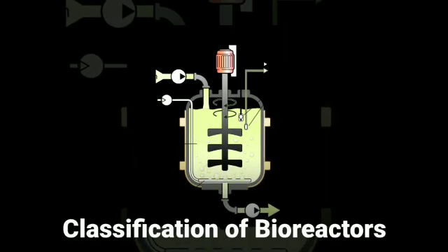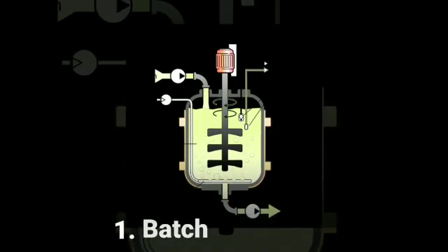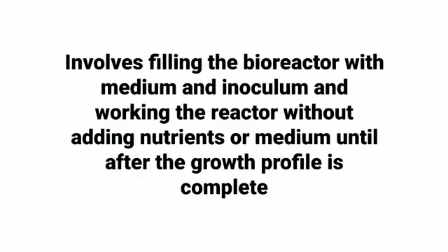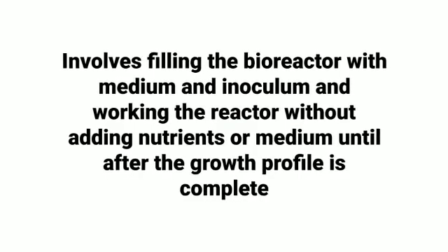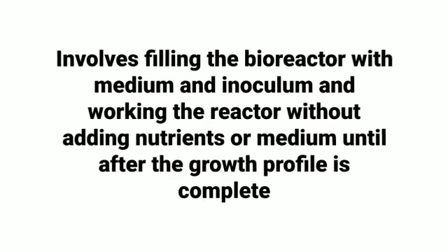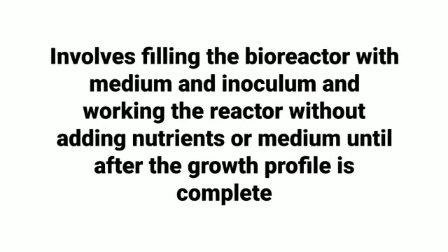Next is classification of bioreactors. On the basis of mode of operation: batch, fed batch, or continuous. Batch bioreactor. It involves filling the bioreactor with the medium and inoculum and working the reactor without adding nutrients or medium until after the growth profile is complete.